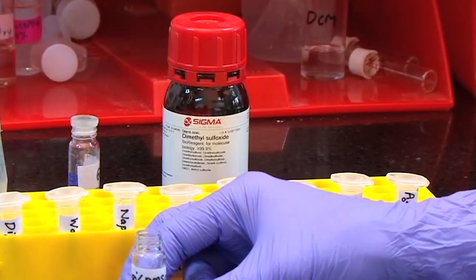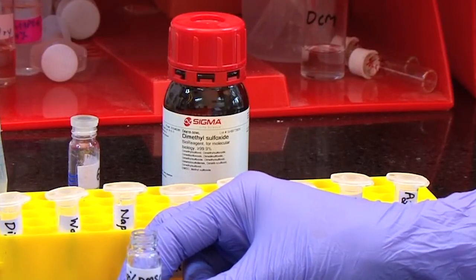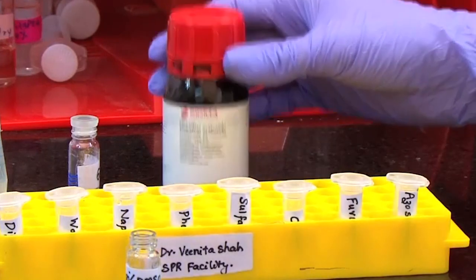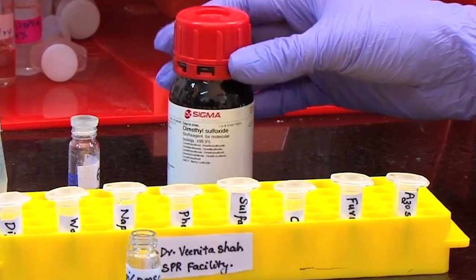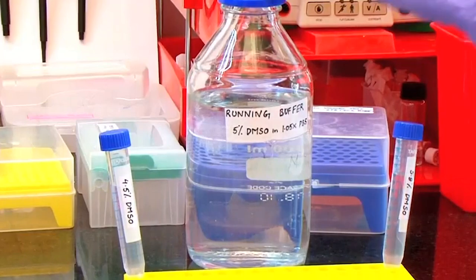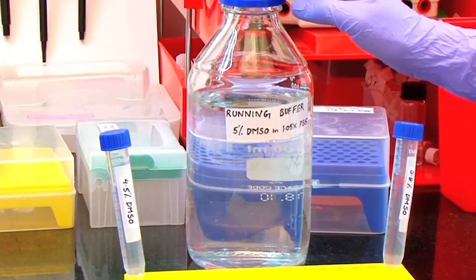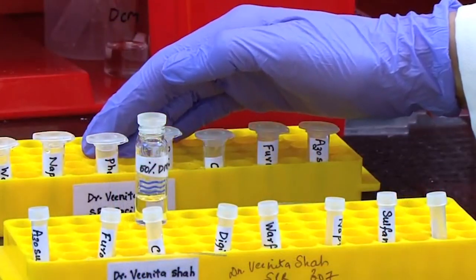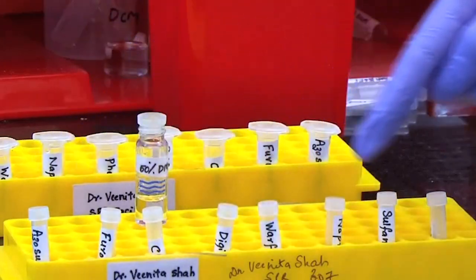For washing, we have also prepared 50% DMSO in water using 600 microliter of DMSO and 600 microliter of water in a 16 mm vial. Running buffer will also be used as negative control in this experiment. All of these samples and reagents have now been aliquoted in the required volume in these specialized tubes.